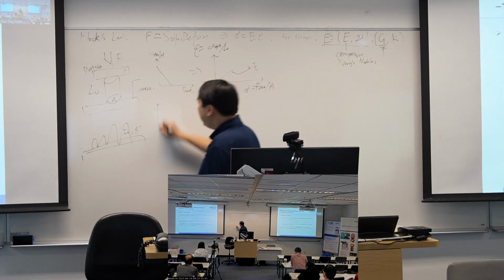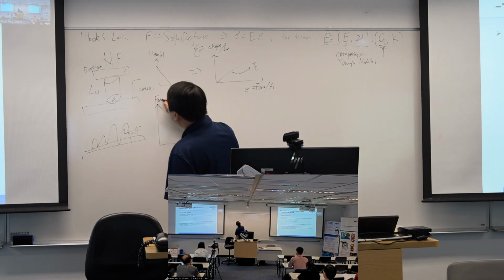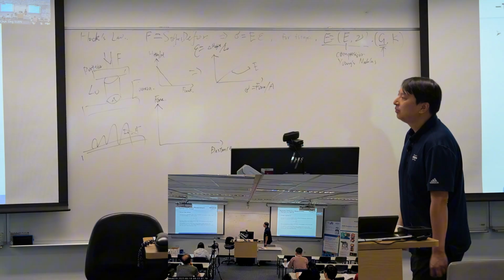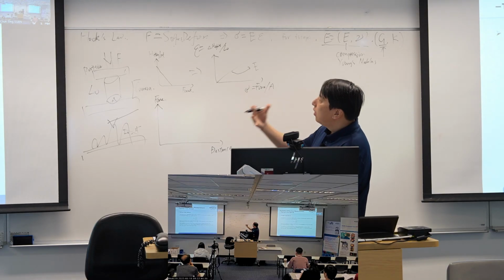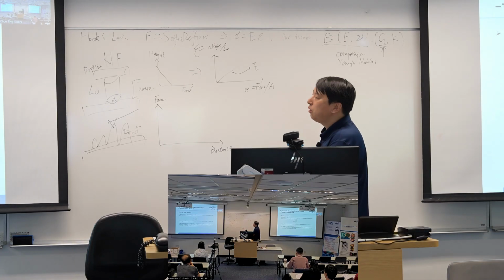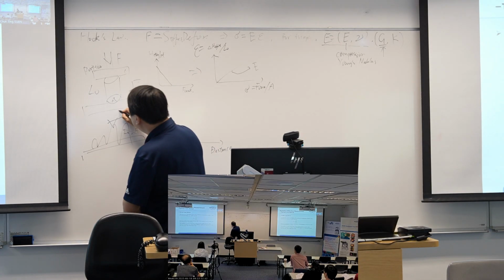Instead, we have to capture a force against distance curve. Okay, for AFM, we are using a probe, and the transducer or the force sensor we are using is a beam, which is named a cantilever.